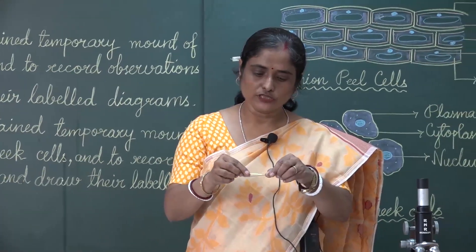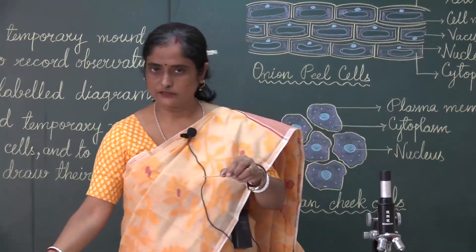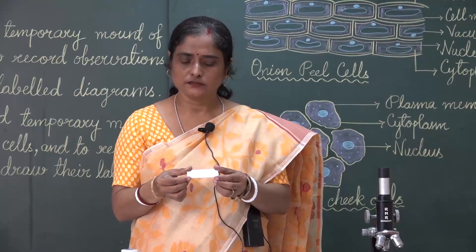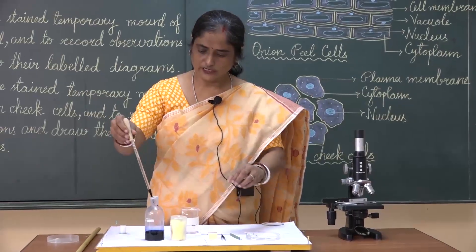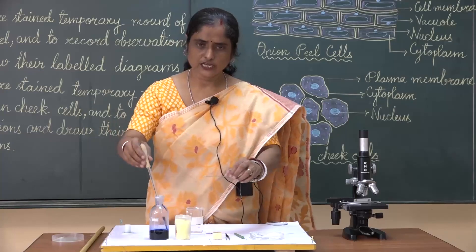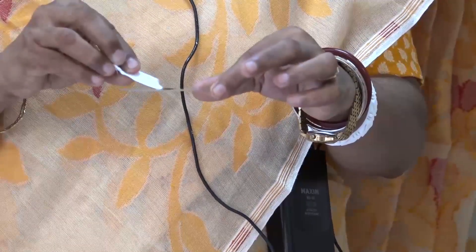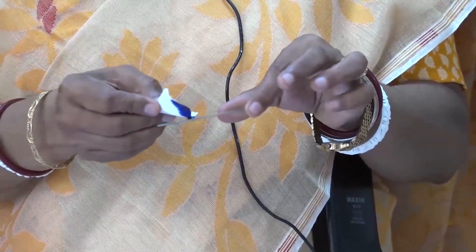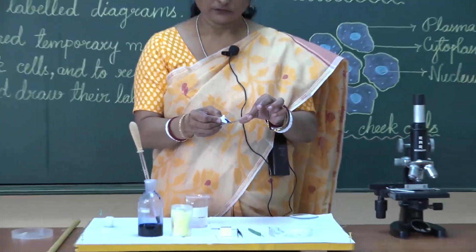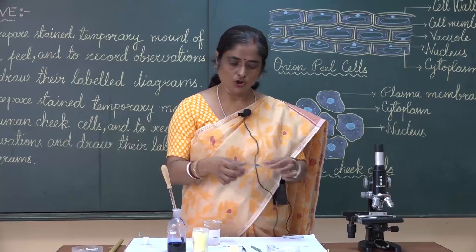Take the scrapings and put them on the slide, and the used toothpick has to go into the bin. The scrapings are put on the slide — you cannot see them as they are white. So we should not let it dry and should immediately put a drop of stain. If there is excess stain, take a blotting paper and at the corner, try to soak the extra stain. The material should not come out into the blotting paper — take care. Once done, all the extra stain is removed.